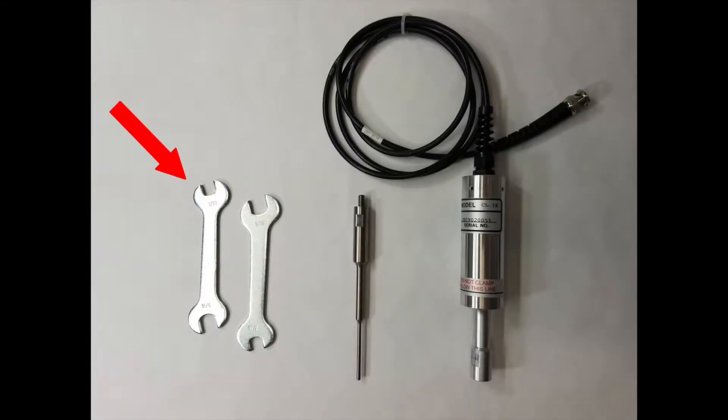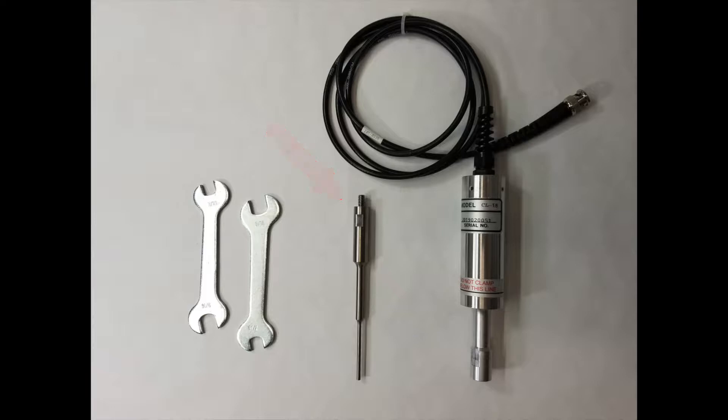These are the wrenches that come with your system. This is the 1/8-inch microtip probe, and this is the CL18 converter.